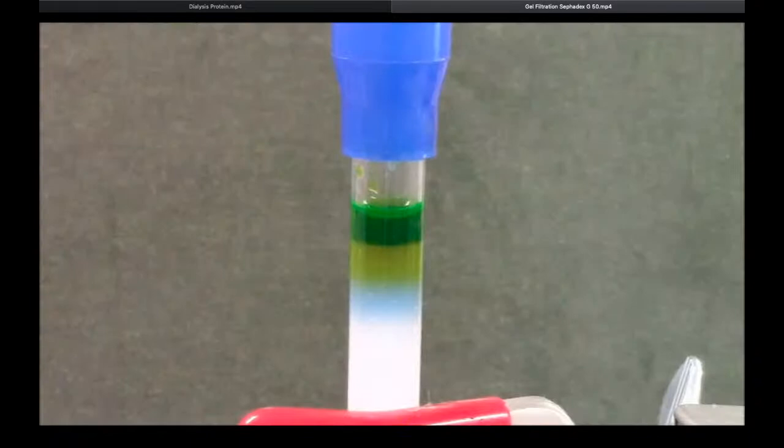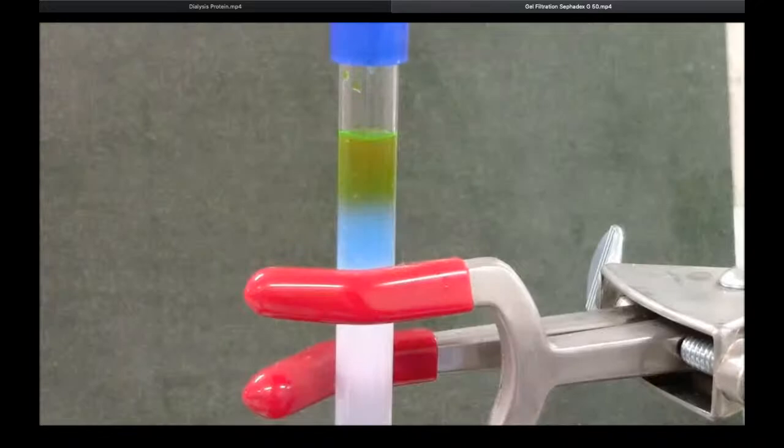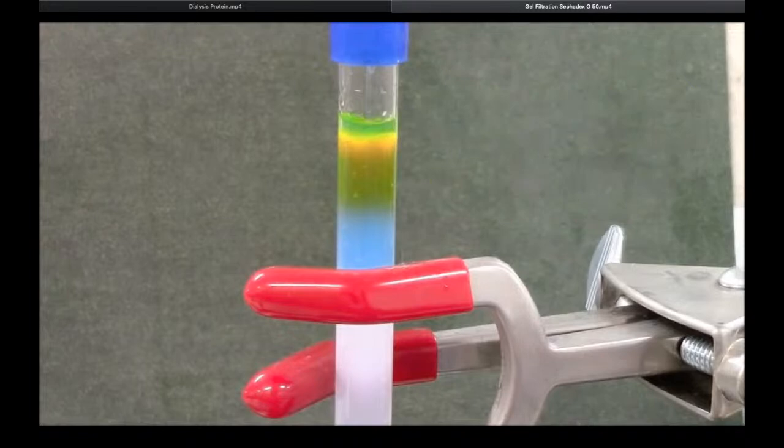So here you can see the blue molecules, the large molecules, are moving faster through the gel. So I hope that I can get a complete separation between the blue and the yellow. Now the excess on the top of the gel is all soaked in. So I'm adding buffer very carefully to the top of my gel filtration column. I'll just add a fraction of a milliliter first to help get everything into the gel before I add a large volume of buffer.